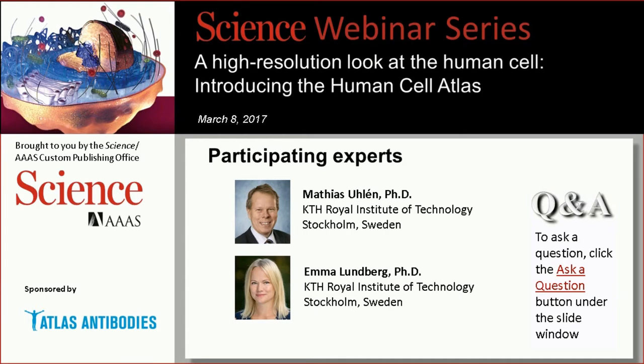Great. I had a second similar question asking about whether you have antibodies that distinguish any splice variants. Yes, so we have some antibodies that do. We try to make 3 to 4 different antibodies for every target protein, and we try to design them to target all isoforms, but sometimes we also make antibodies that target 1 or 2 different isoforms. So in the protein atlas, you can see the exact antigen sequence that was used. So you can see if the antibody is targeting 1 or 2 or 3, and how many of the isoforms it's targeting. All of this is publicly available, and you find it under the antigen tab in the atlas.